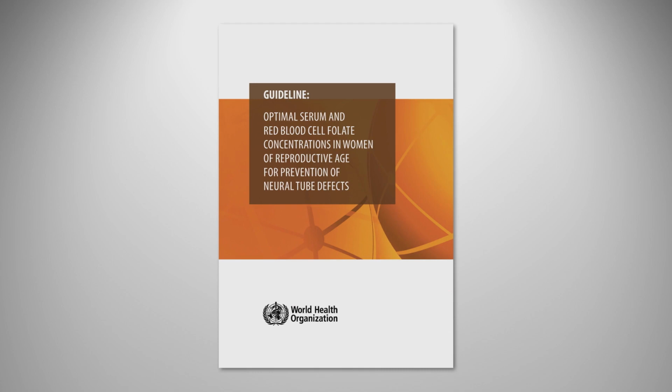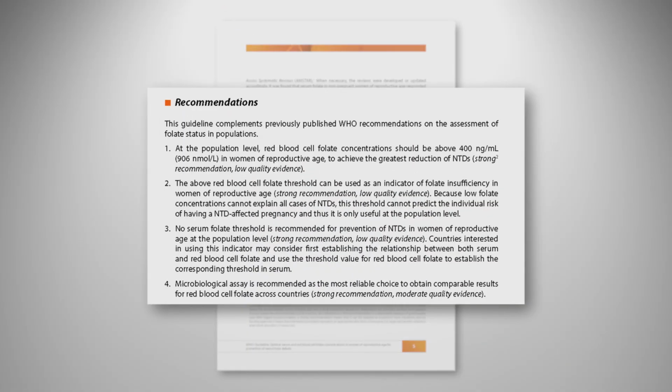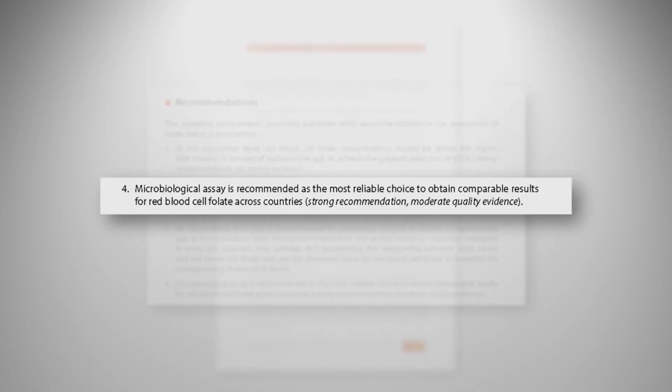A recent guideline published by the World Health Organization provides this information and recommends the use of the microbiologic assay to assess folate status in population surveys.